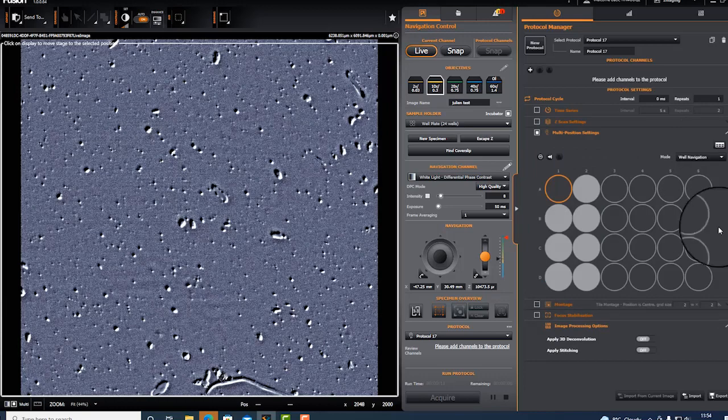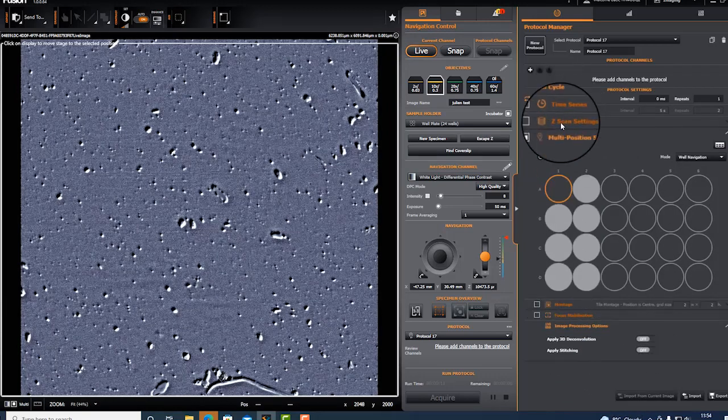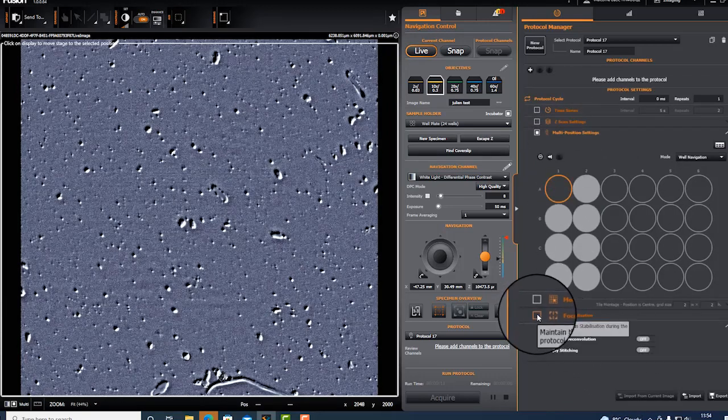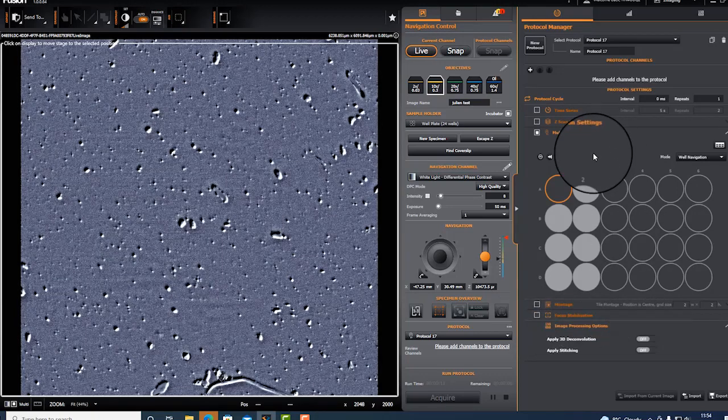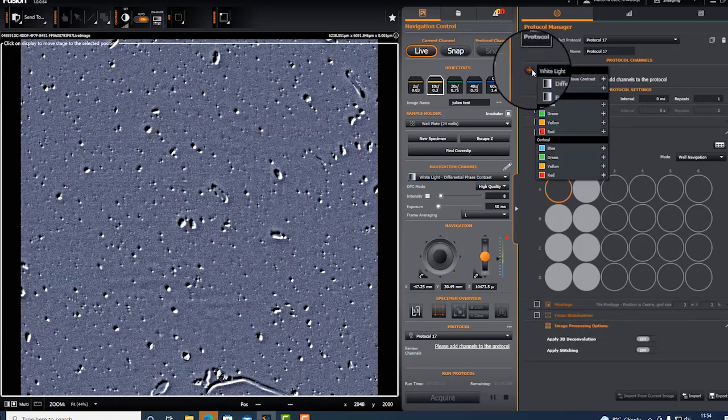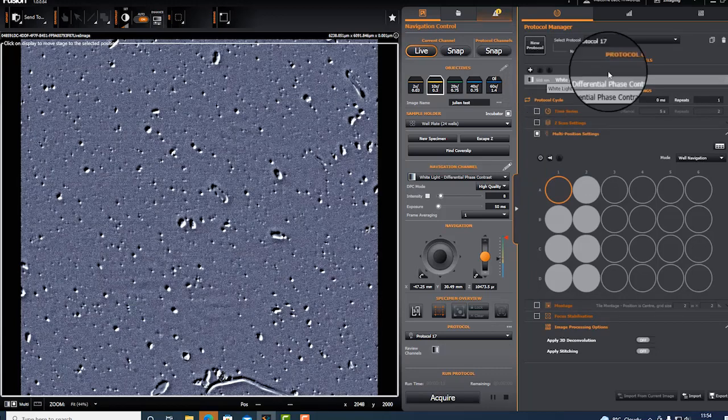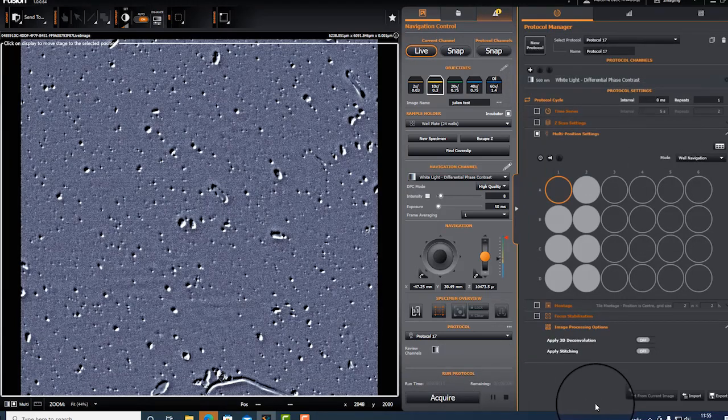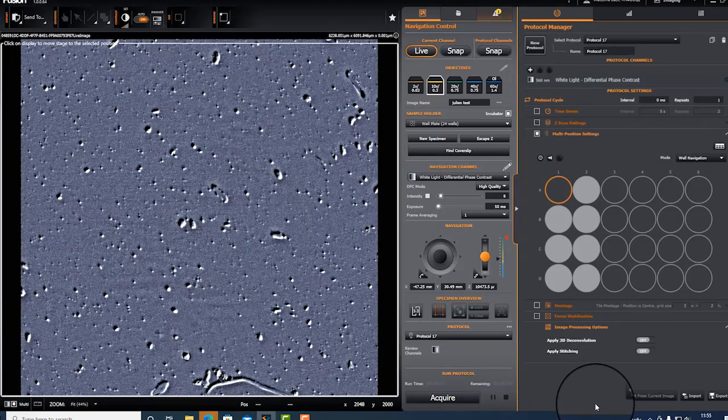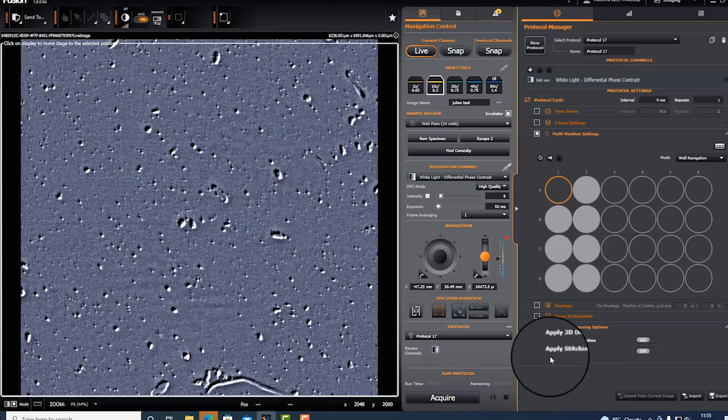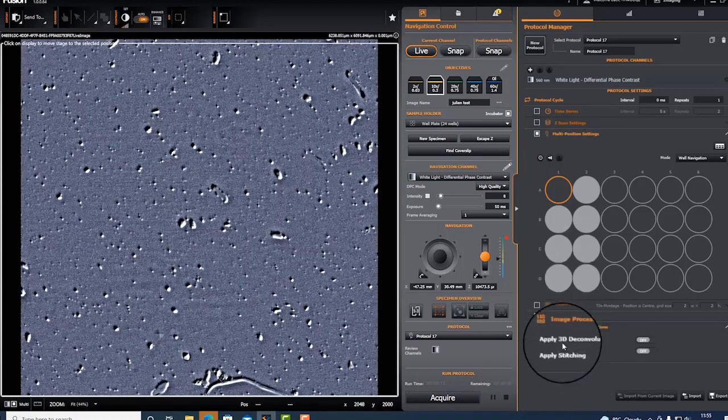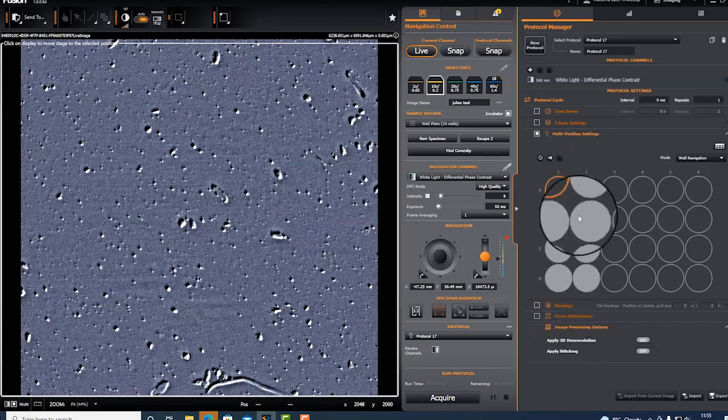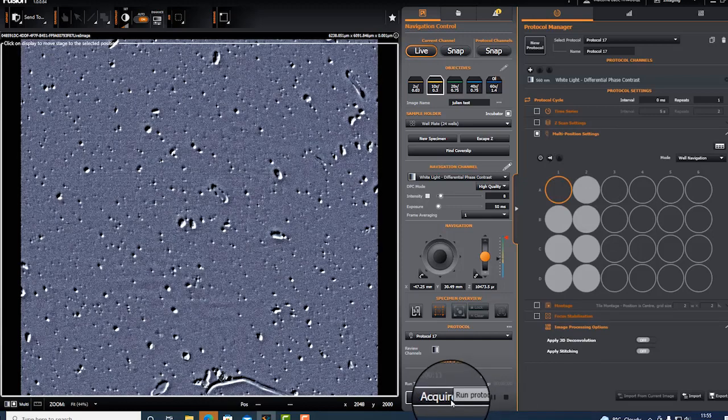The multi-position or multi-well plate can be combined with montage, with z-scan, with time series. You can apply focus stabilization. Once you're happy, you need to set the channels. In this case as I don't have any sample, I just have transmitted light and you can see just a bit of dirt. I would acquire one position at each well.